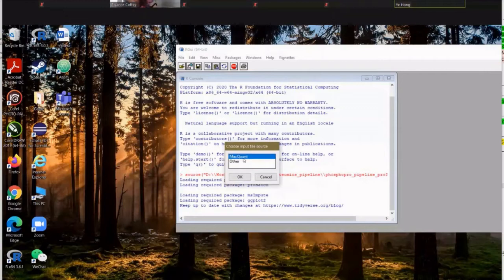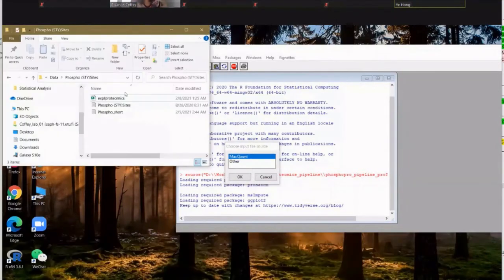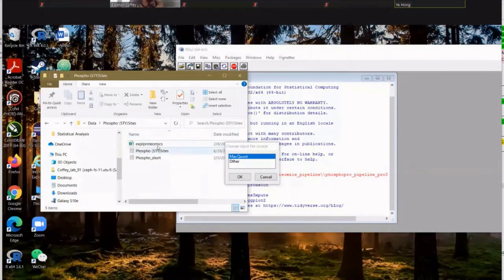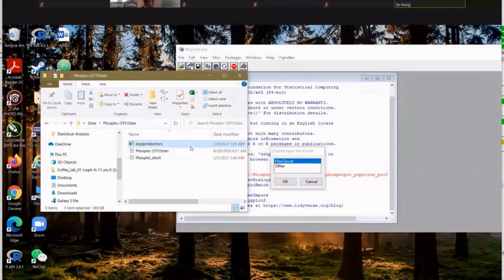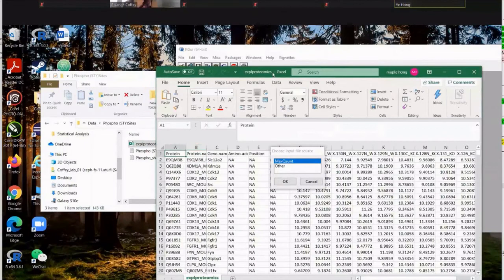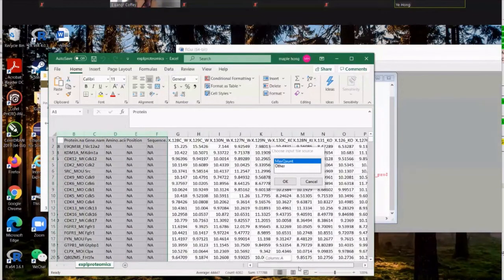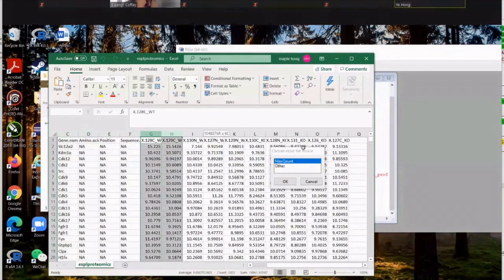I can show an input from a normal peptide proteomics peptide file instead of a phospho file. So this is basically, the first 6 columns are annotations, names and things, and then all the rest are data columns.